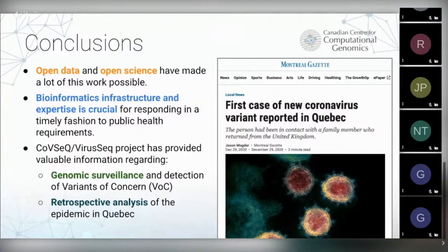And you can do that with nanopore because the read covers the whole amplicon, but right now we're not doing full haplotype detection across the whole virus genome, because that's a limitation of this kind of amplicon-based strategy.